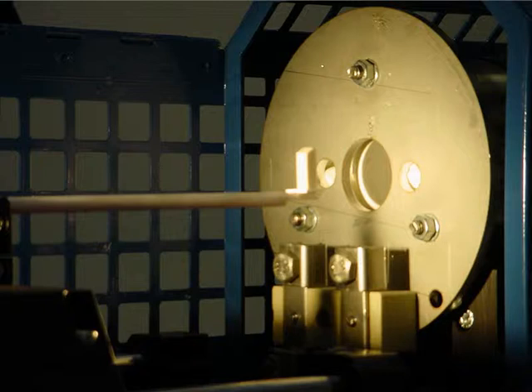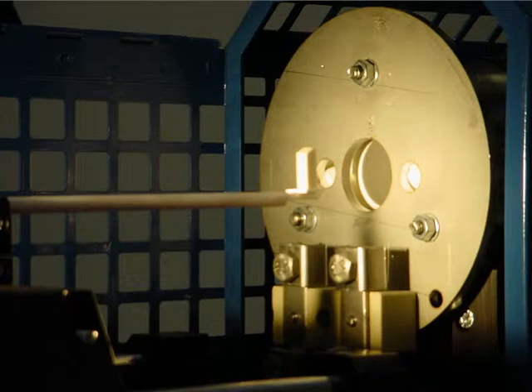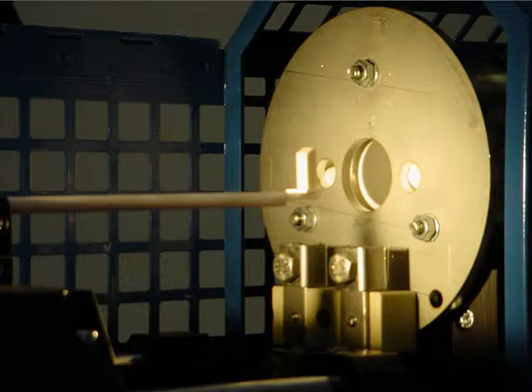The sample is 15 mm high with a base of 5 by 5 mm. The sample can be cut from a piece of raw or fired material using a diamond blade, which can be supplied as an accessory.